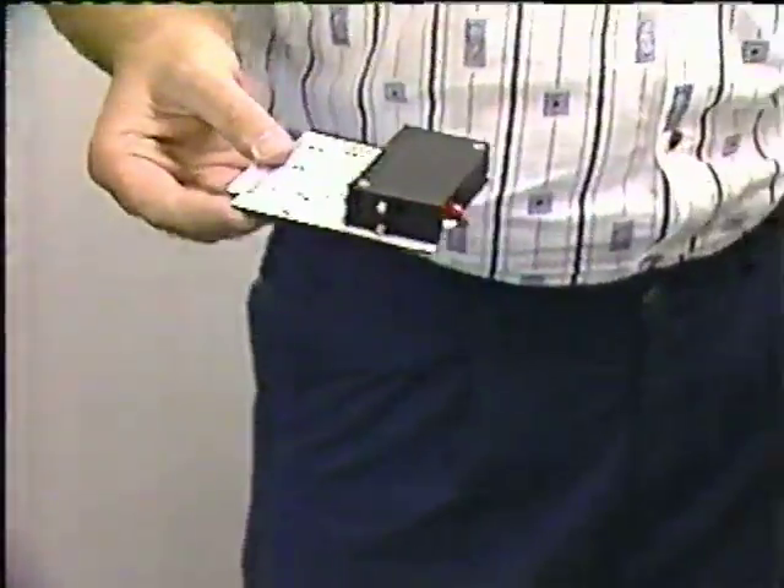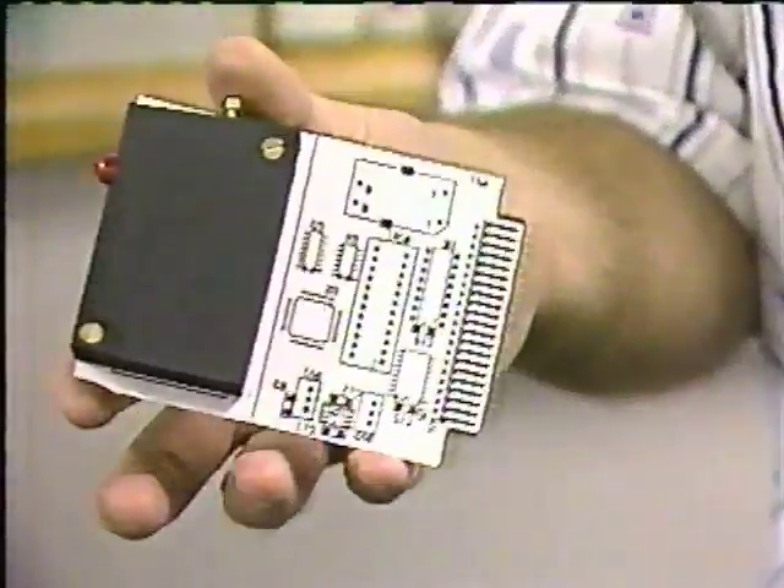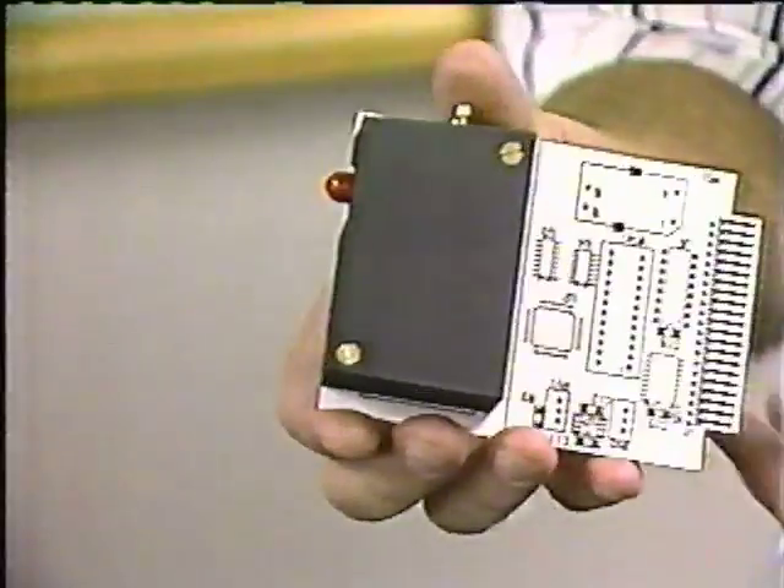We really and truly feel that we will do to the spectrometer market what the silicone chip did to the computer market. Usually, spectrophotometers are as big as a desk and cost $25,000 to $100,000. We've developed a miniature one you can hold in the palm of your hand that does the same thing — about 1,000 times smaller and about 10 times less costly than existing instruments.